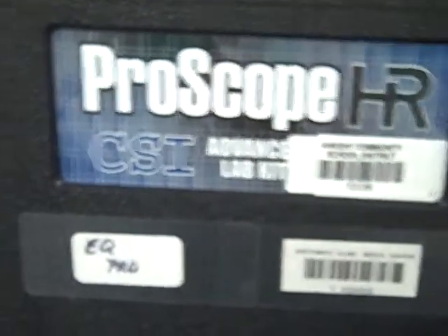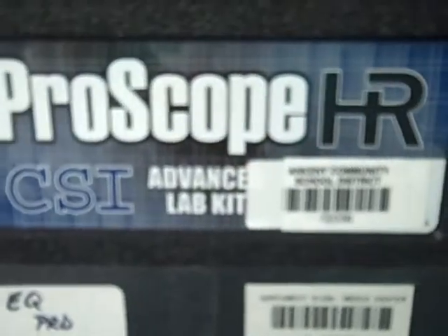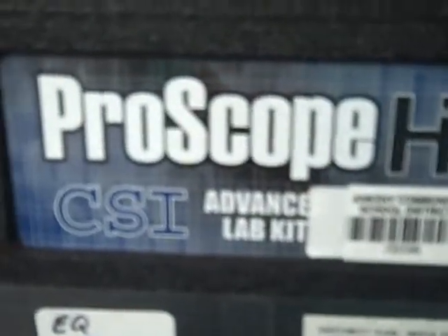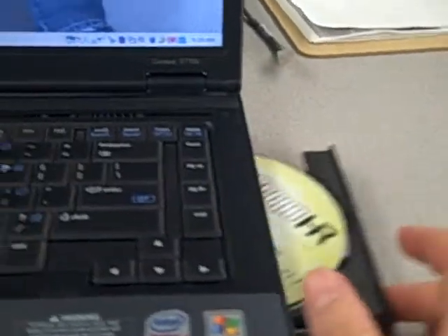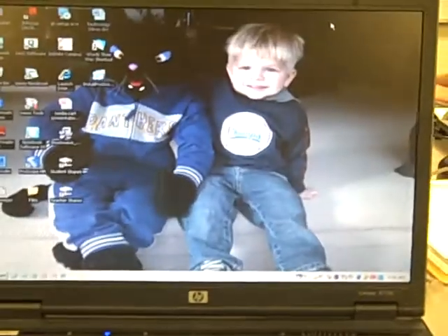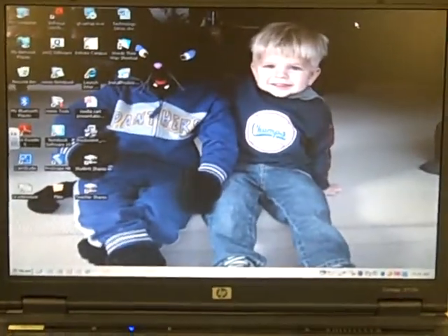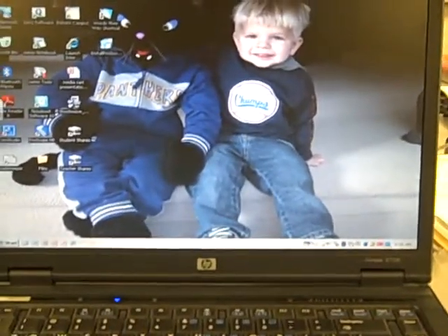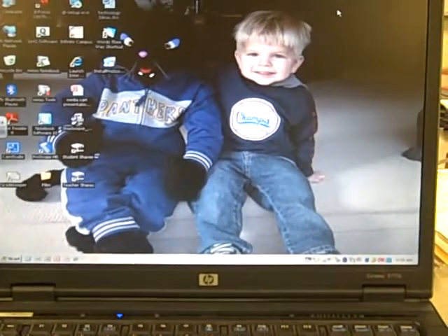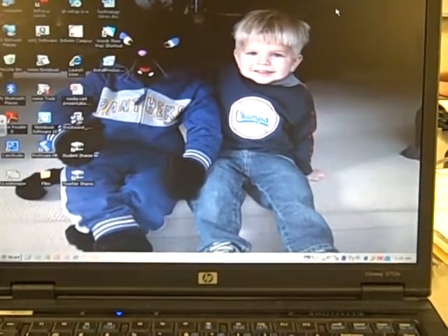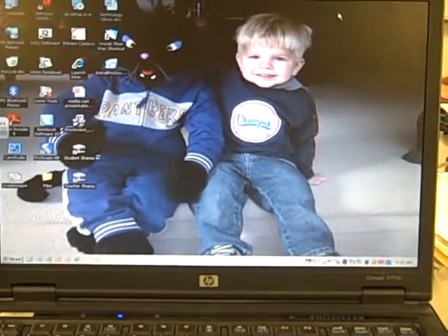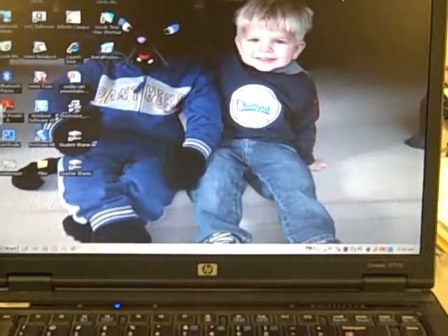The first thing you're going to do is take the install CD out of the kit, black box, and put it into your laptop, and wait for a screen to open up. It'll take just a minute.